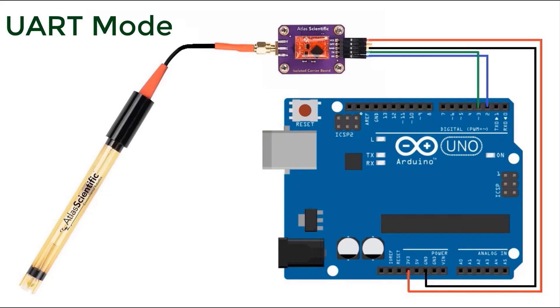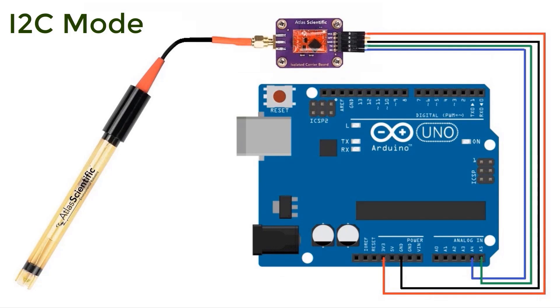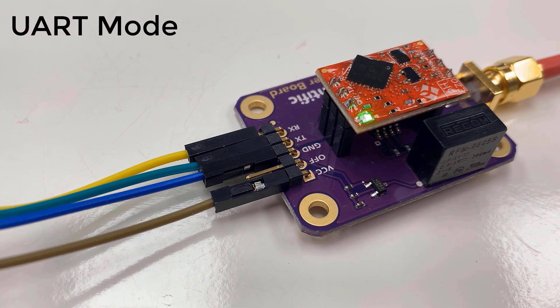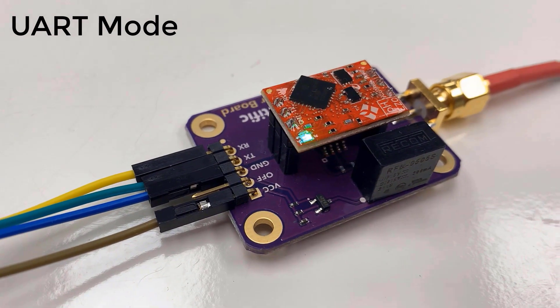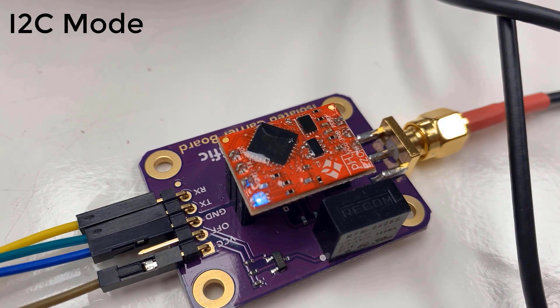You can interface the sensor in UART mode using TX and RX pins — follow that connection. Another way to interface the sensor is using I2C mode — follow that connection. The question is: how do you identify whether the sensor is in UART or I2C mode? There is a color indication LED. If the LED color is green, it's in UART mode; if the color is blue, it's in I2C mode.